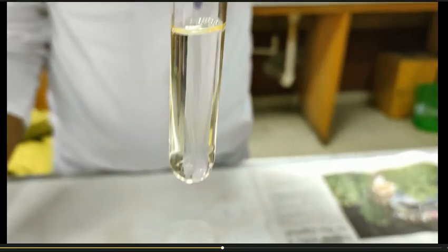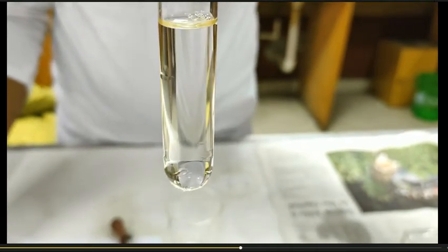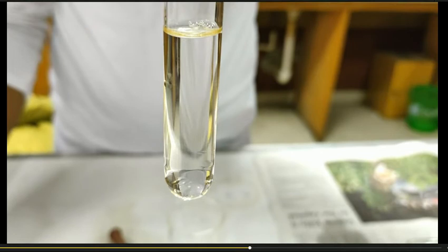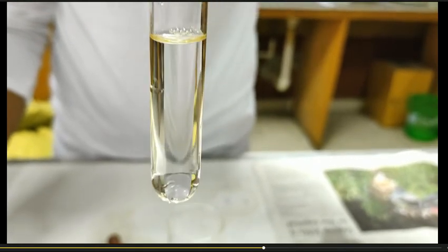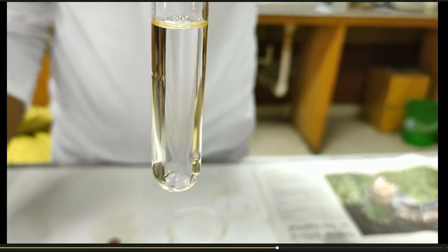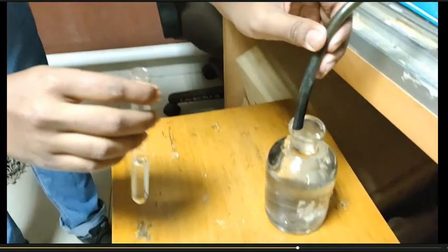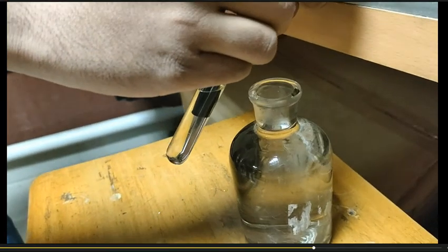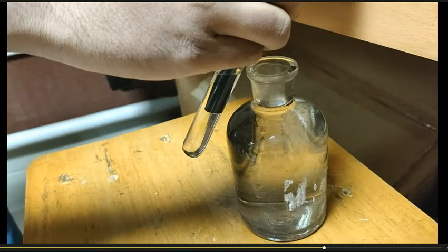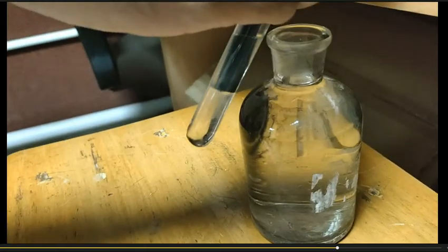The PPT will reappear when hydrogen sulfide gas is blown through this solution. We are going to add hydrogen sulfide gas into this solution, and this will cause reappearance of the PPT, indicative of the presence of zinc ion. Applying hydrogen sulfide gas in the test tube causes the PPT to reappear.